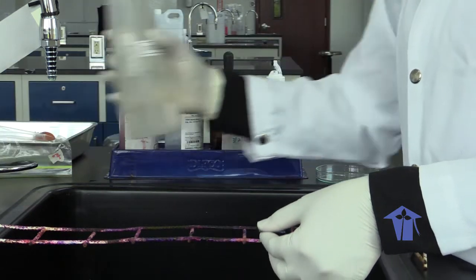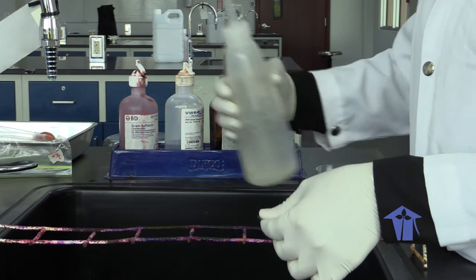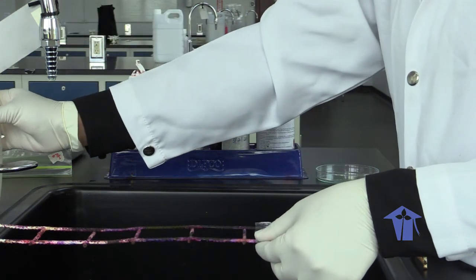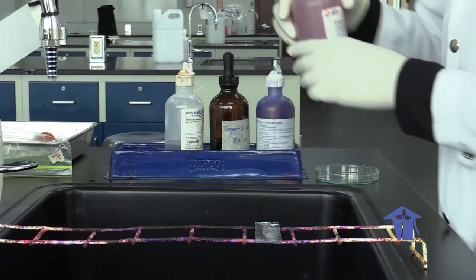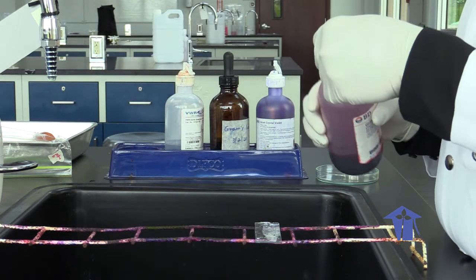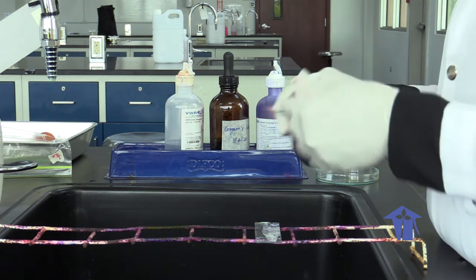Then you wash with distilled water, 2 seconds. And then finally, our fourth solution, safranin. We add a couple drops of safranin, 2 to 3 drops of safranin, and you leave it for about 20 seconds.